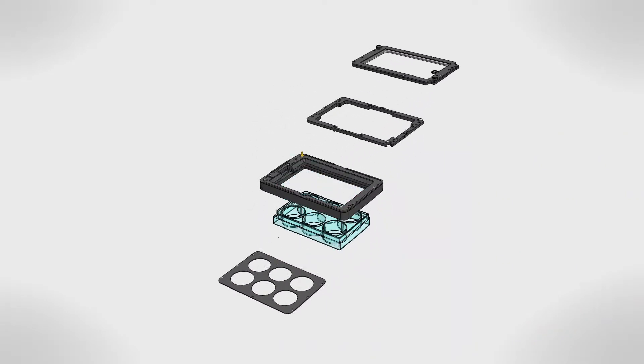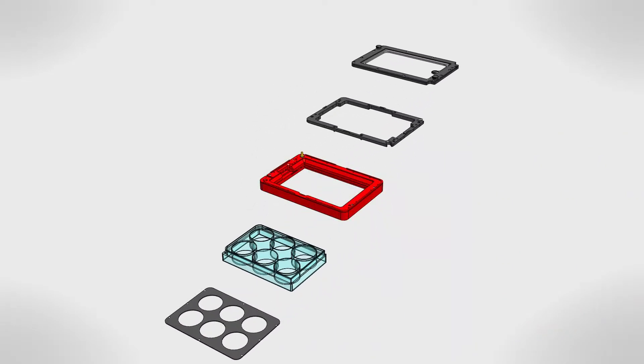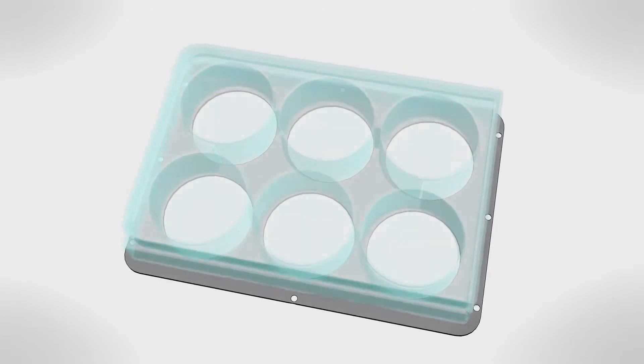The chamber is made of four pieces: the chamber main body, one interchangeable specimen holder, a heated glass lid and a removable chamber riser required to fit multi-well plates inside the chamber.